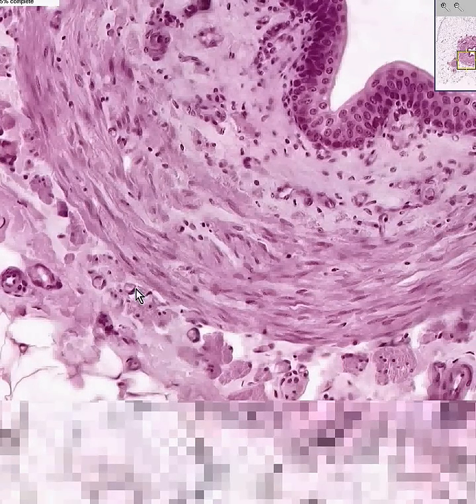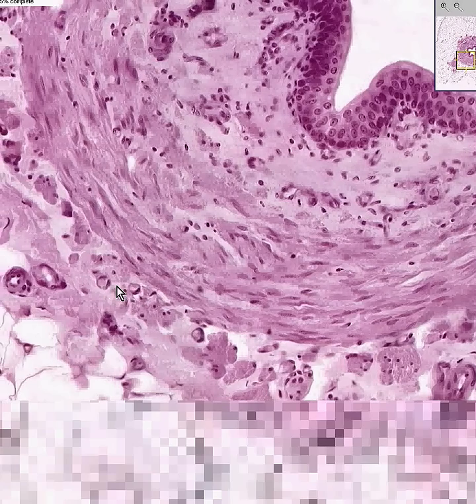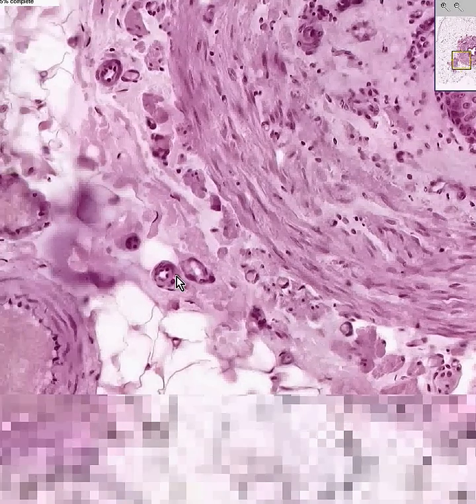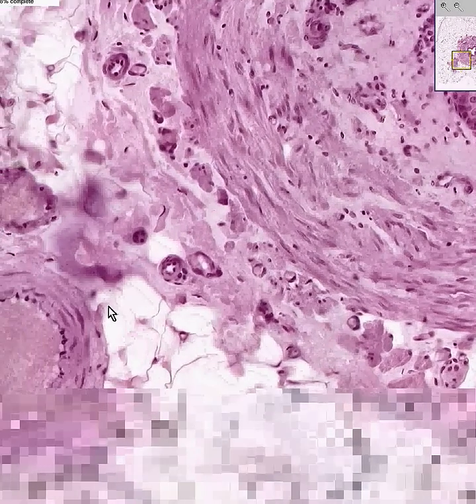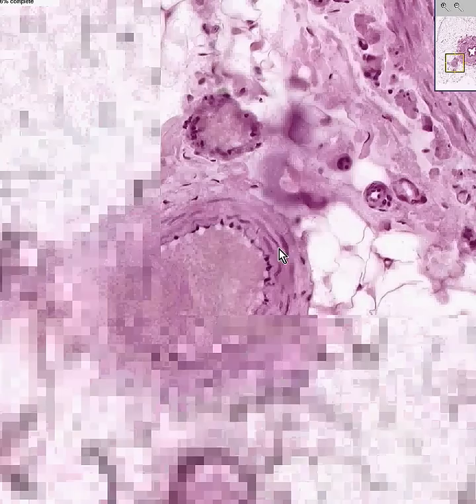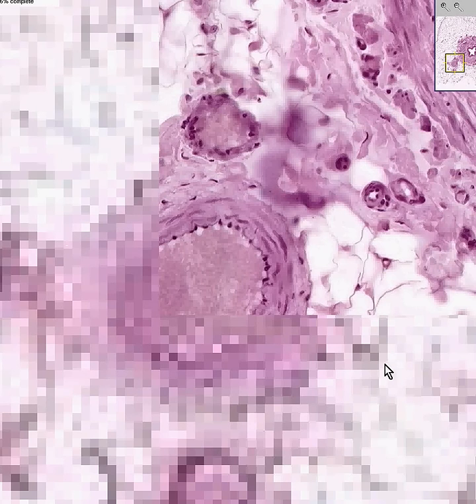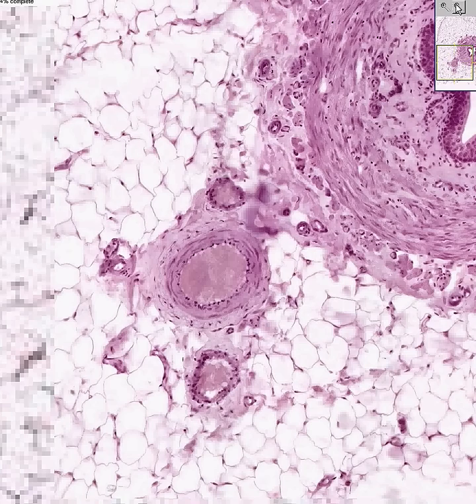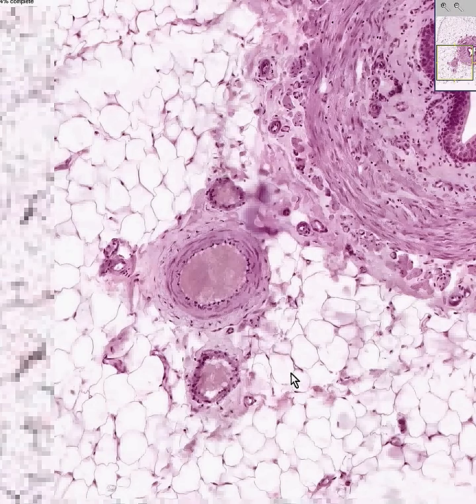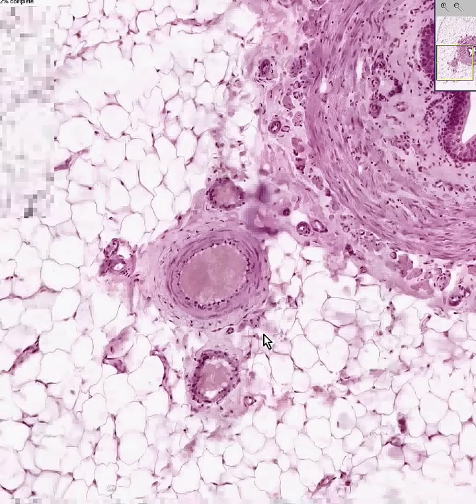Here's a very small blood vessel, perhaps a capillary or an extremely small vein. Here's a small artery. Here's the wall of a large artery. And here is the fat, or loose connective tissue, pretty much surrounding everything. This is retroperitoneal fat. I thank you very much — no need to waste our time anymore on the ureter.